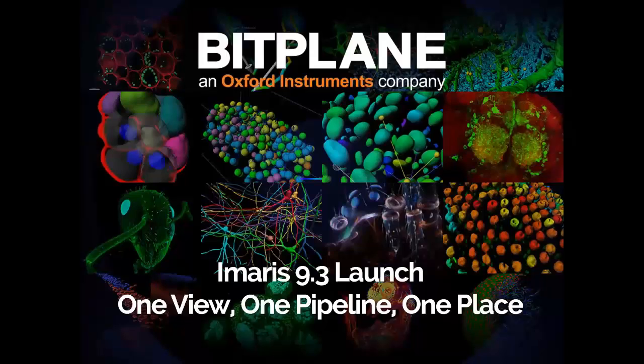First off, as you can probably tell from my accent, I am American, but I'm sitting here in the Zurich office of BitPlane, where the majority of our developers work. We do have some others based in Belfast, Northern Ireland. It's great to be here as we're launching 9.3, because we're especially excited for the release of this product in particular. We believe it really will solve a lot of the problems and headaches that our users have faced, so we're looking forward to seeing lots of happy, smiling faces as we chat with our users in the next few weeks.